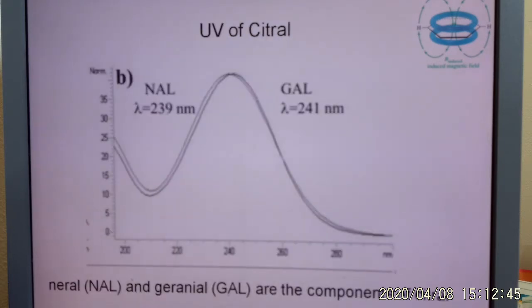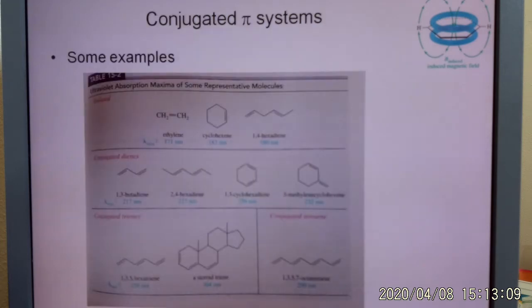Okay, so here's citral. You guys have made citral. If you look at neral and geranial, they have very similar absorbances, but there's a slight difference, so you can actually do a comparison between the two.